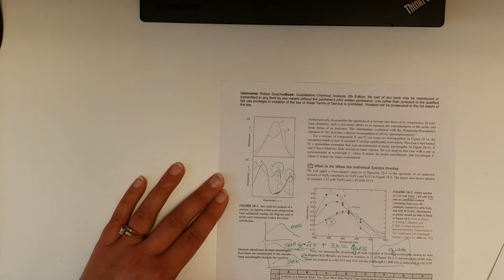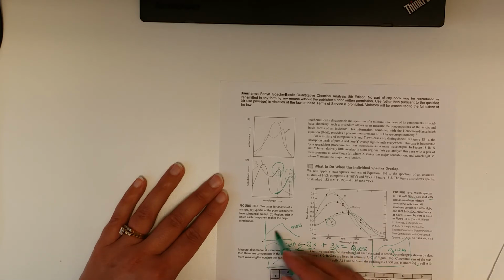We say, well, if I compare my guess to the real one and keep adjusting the 3 and the 2, maybe I do a little bit less of that and see, do they match better? Maybe I do a little bit more of this, do they match better? Eventually you're going to fit some weighting, the 2, for example, of that, and some weighting of this in order to fit this curve. Oh, great.